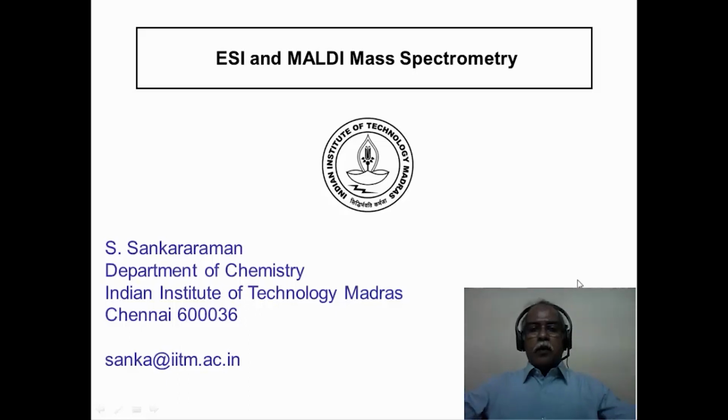Hello, welcome to Module 21 of the course on application of spectroscopic methods in molecular structure determination. Now we have electrospray ionization mass spectrometry and MALDI mass spectrometry to cover in these few modules that we will be dealing with in the next couple of weeks. First we will start with the electrospray ionization mass spectrometry.